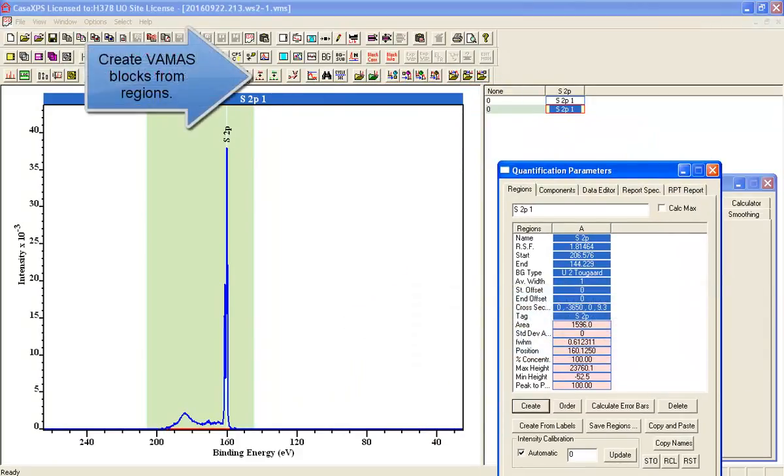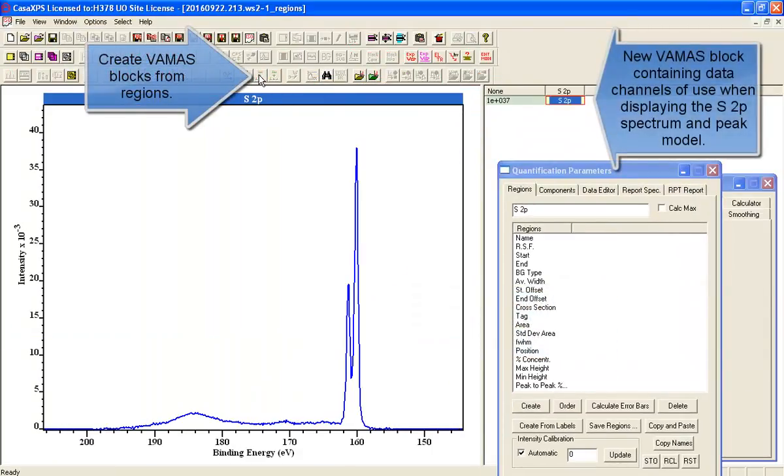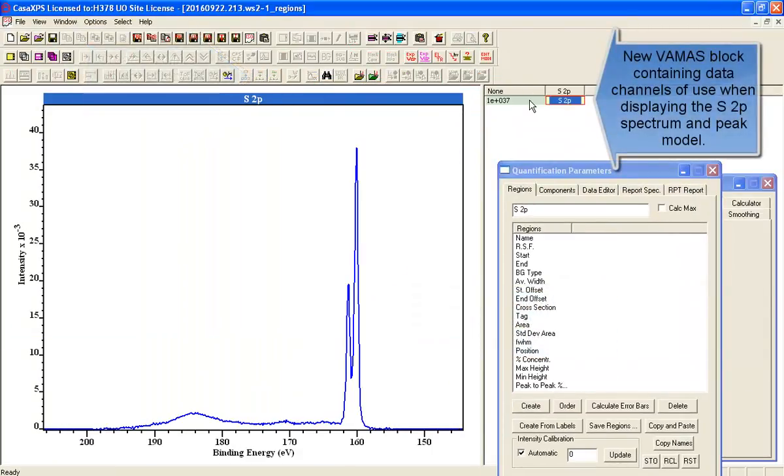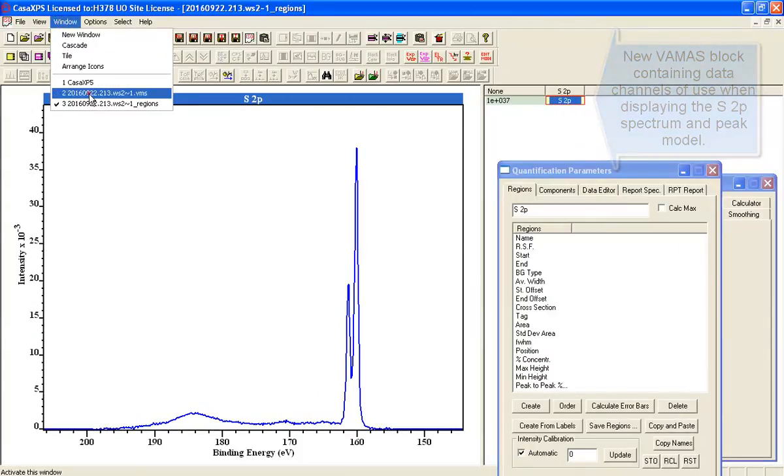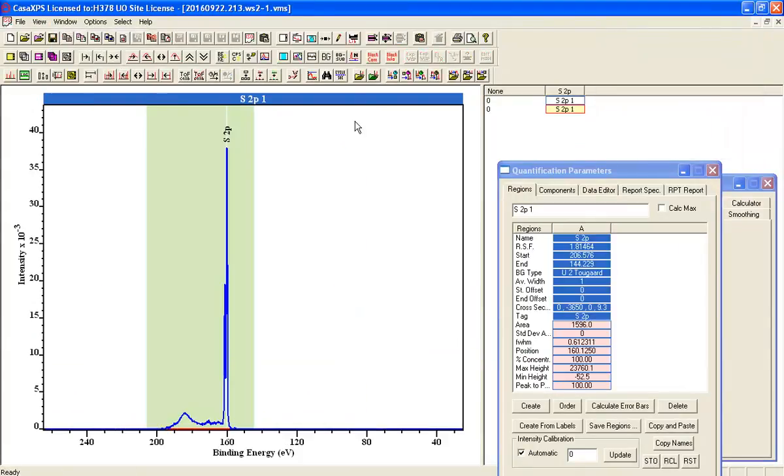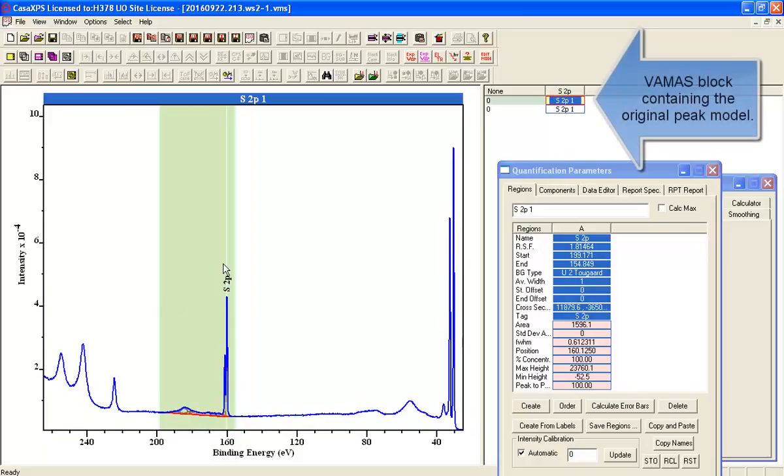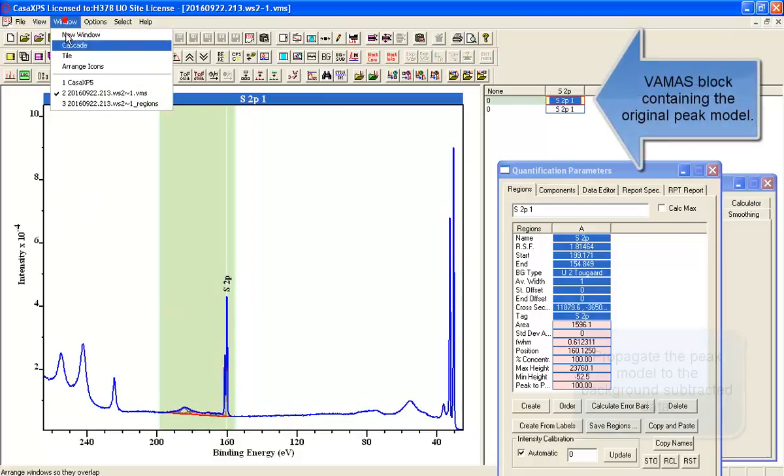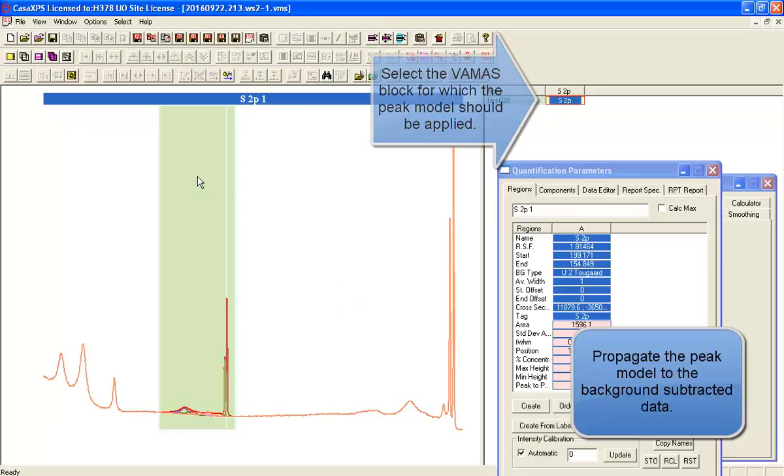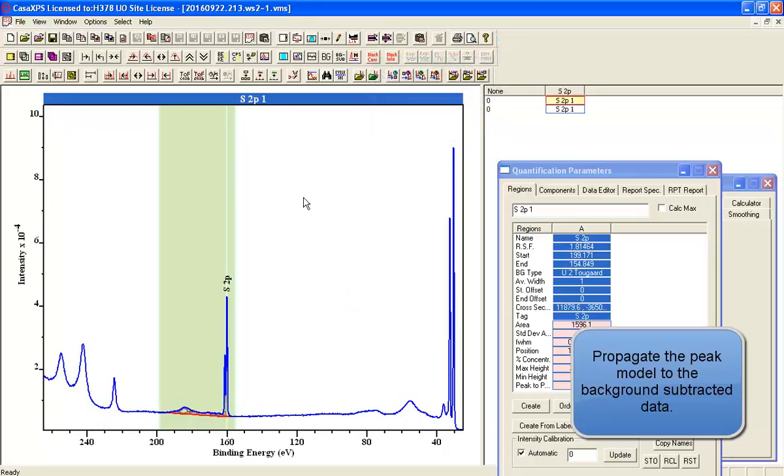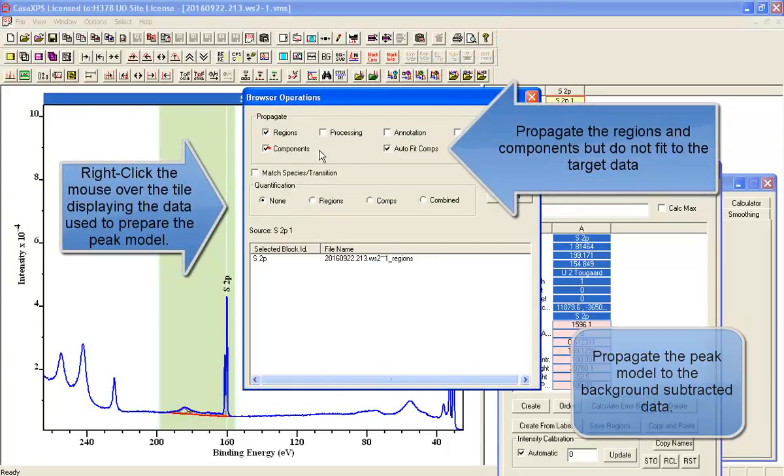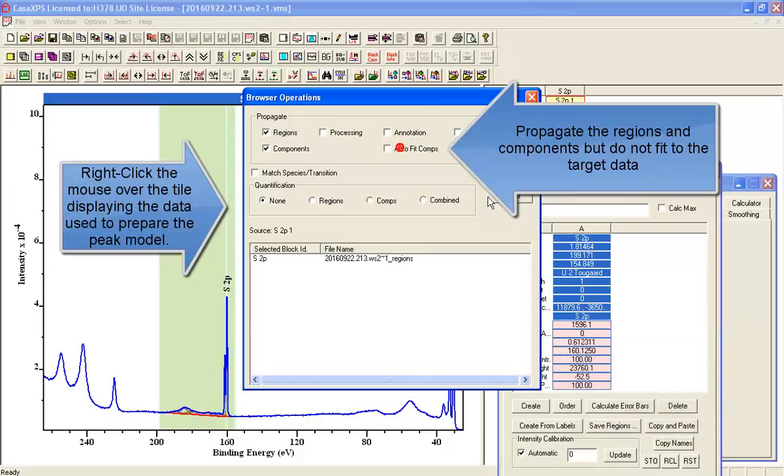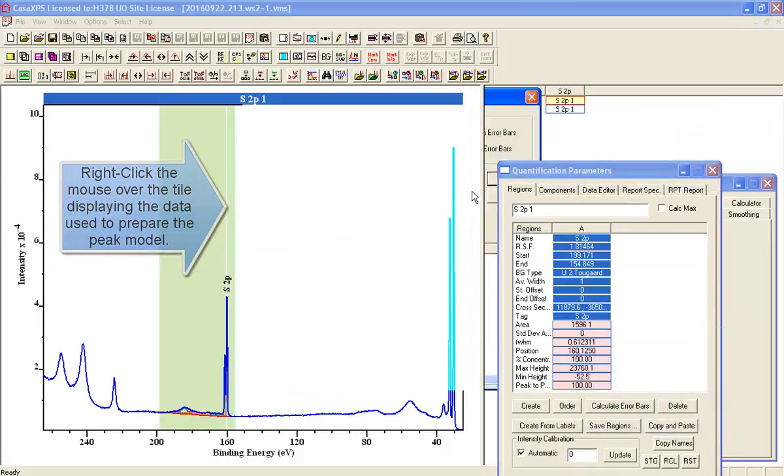And then having created a new VAMAS file containing a VAMAS block that has the background subtracted data, we'll copy by propagation the peak model from the original data onto the background subtracted data. We won't fit for good reason.